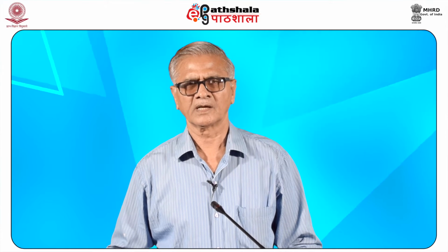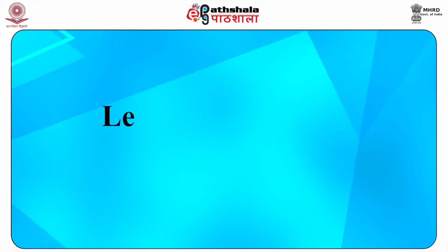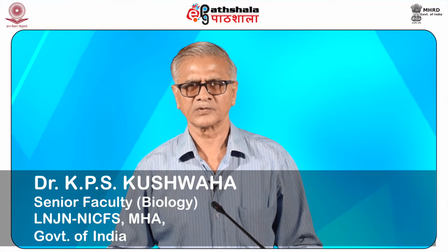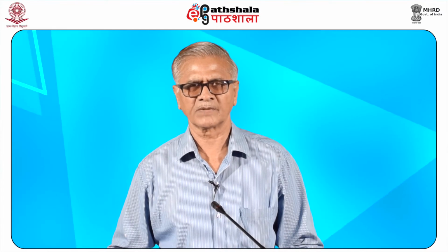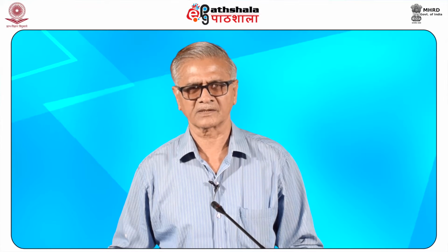Friends, today I would talk about DNA sequencing and analysis. After learning this module, you shall be able to understand DNA sequencing, methods of DNA sequencing and DNA sequence analysis.